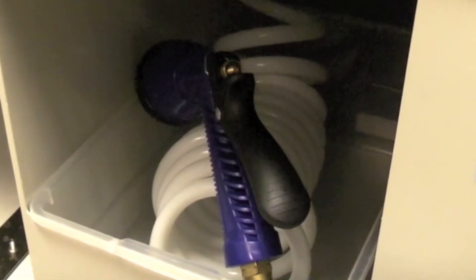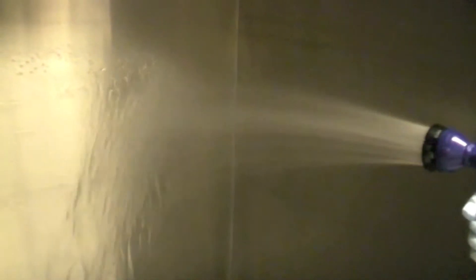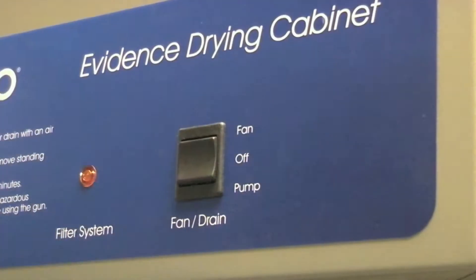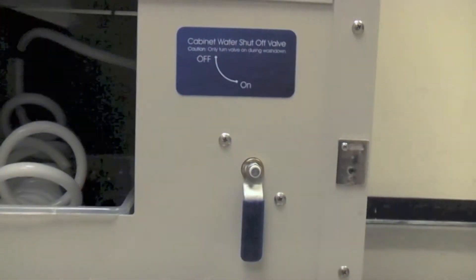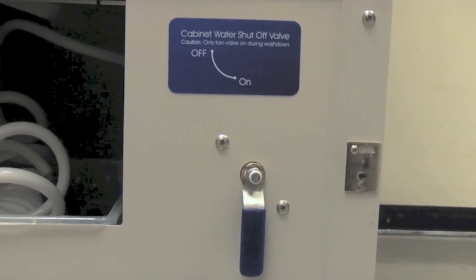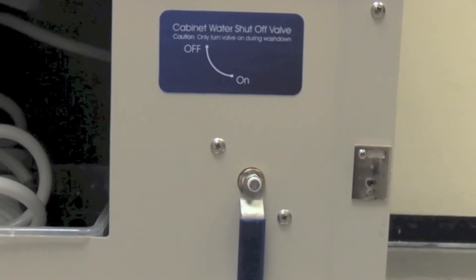The wash down model features a water hose and adjustable spray nozzle used to rinse the cabinet interior. A drain pump is included to aid in cleanup, and an easily accessible supply water shutoff valve is included to prevent water leaks.